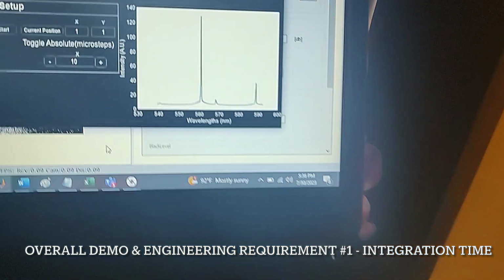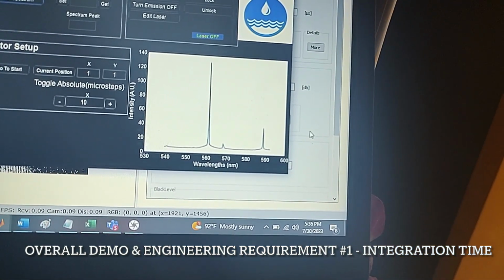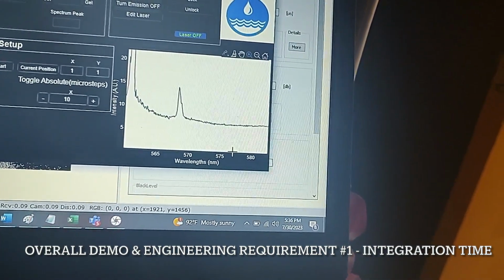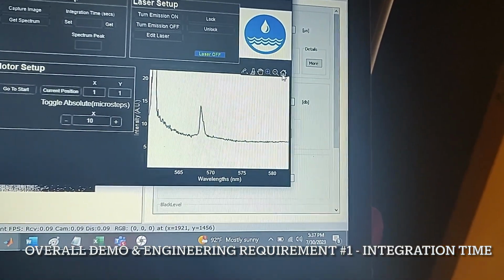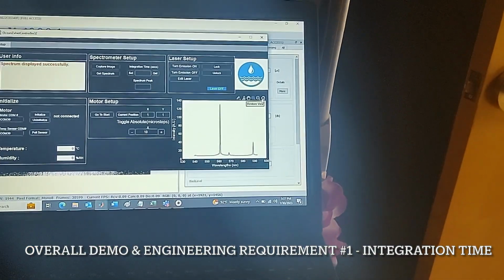And there you have it. There's the spectrum. Go ahead and zoom in on some of the finer details. This is recalibrated, the x-axis, by the way, to fit better lines on the mercury light source that we used. There you have it. Ammonium nitrate, full measurement.